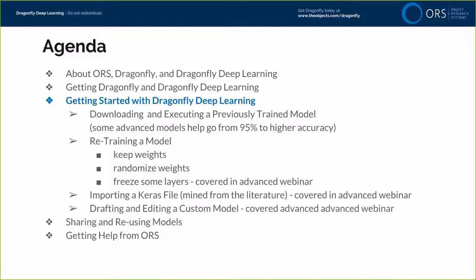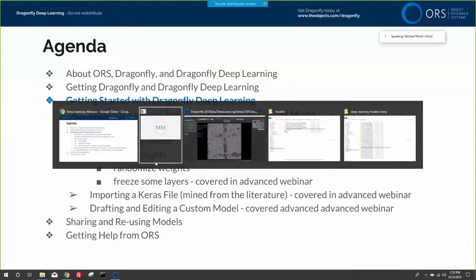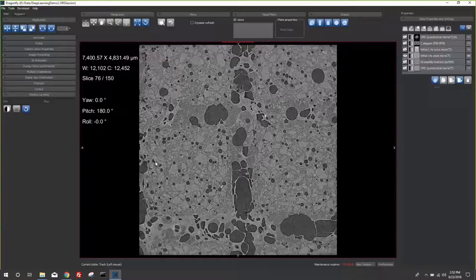Now let's talk about getting started with deep learning. I'll cover how to download and execute previously trained neural network models — some simple, some advanced with up to 95% or higher accuracy. We'll discuss retraining models you download, where you can keep or randomize the weights. Advanced topics not covered today include freezing layers during retraining, importing Keras files directly, and drafting custom models using our GUI without writing any Python or C code.